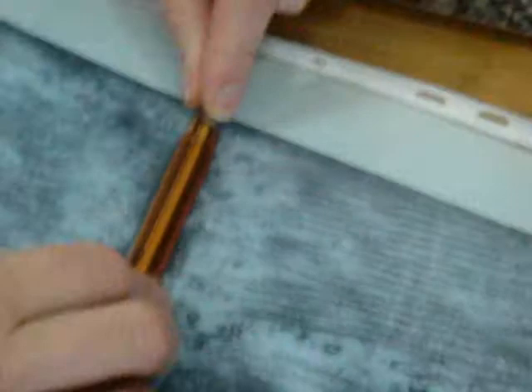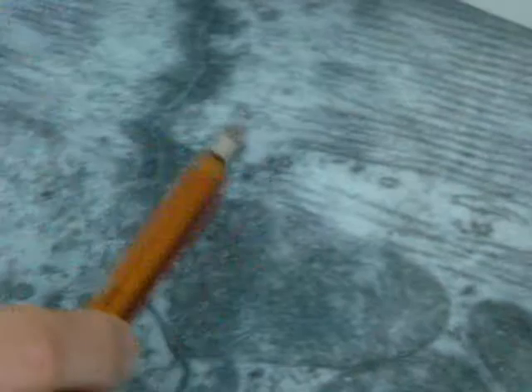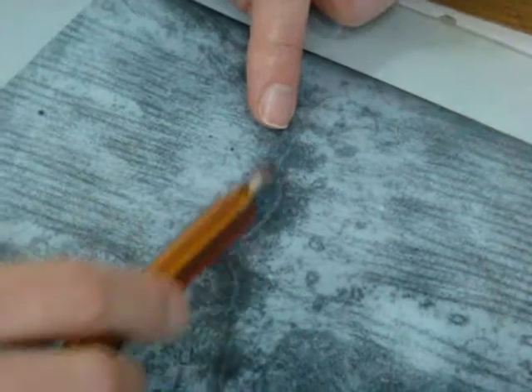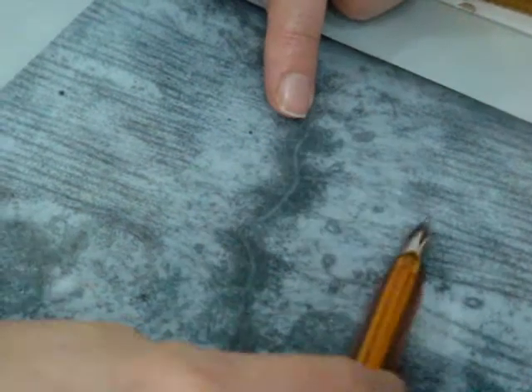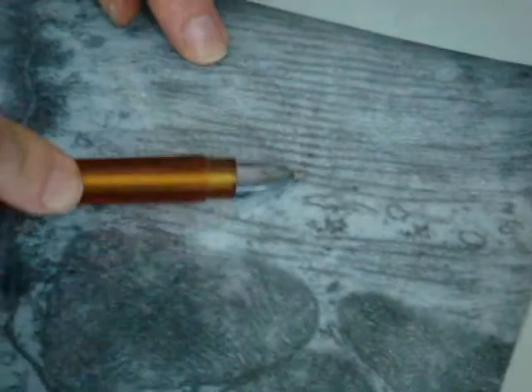But here there must be a Z line. This will be the transverse portion, and thin filaments join to the membrane. These are thick filaments, again thin ones, and the Z line is visible here. H band, M line in the middle. This is a mitochondrion. That's all.